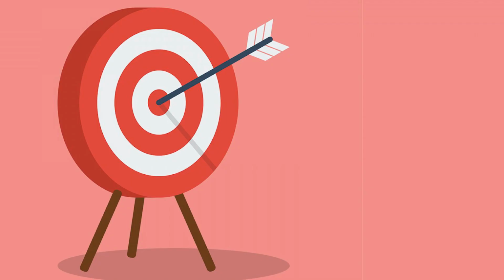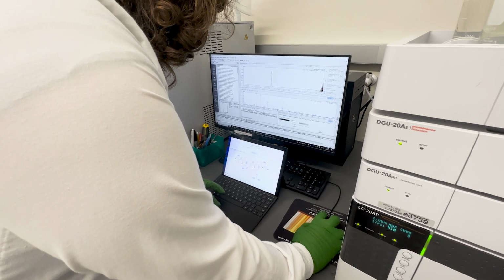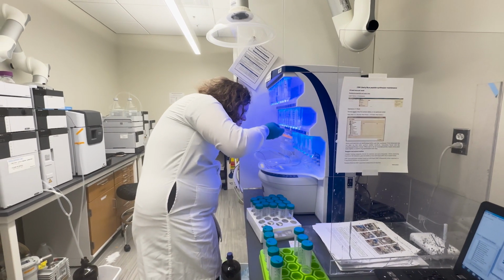treatments and therapies. The overarching goal of our project is to create an application that will allow researchers in the Medina Group to understand the properties of the peptides they made. In doing so, users will be able to both verify that they created the peptide they expected to make and can better understand how to further modify the peptide in later experiments.